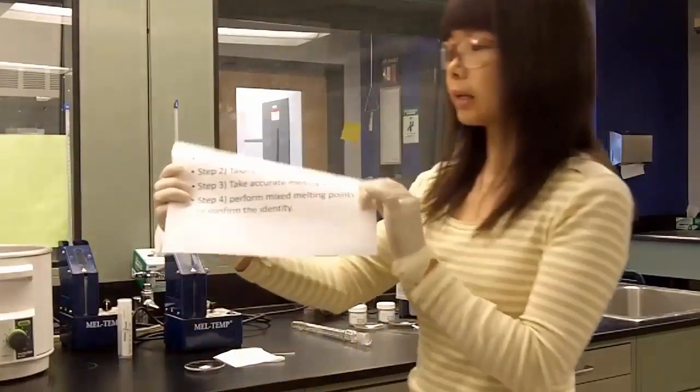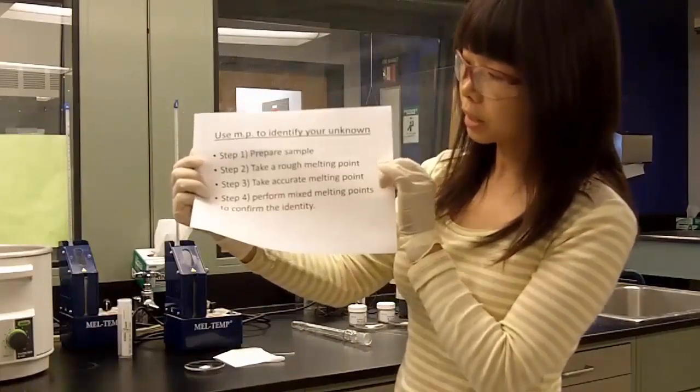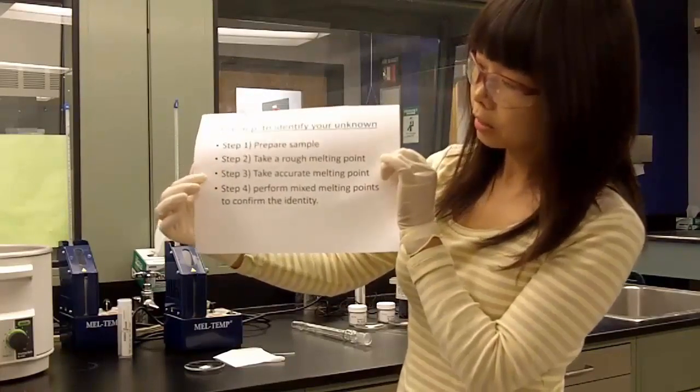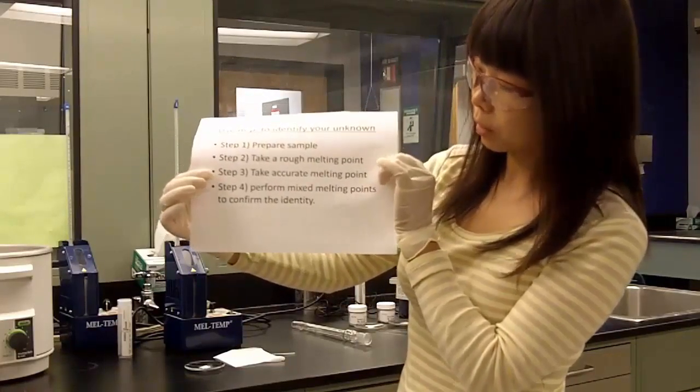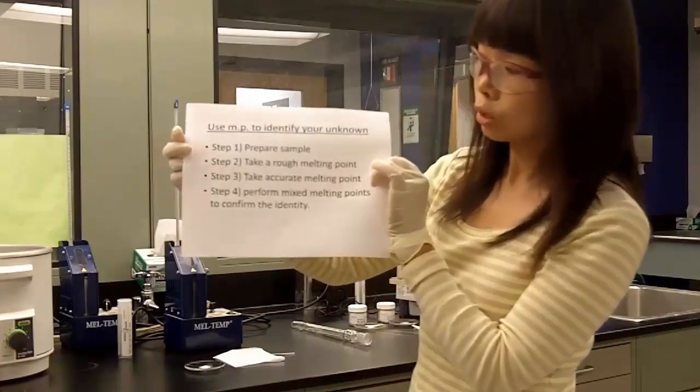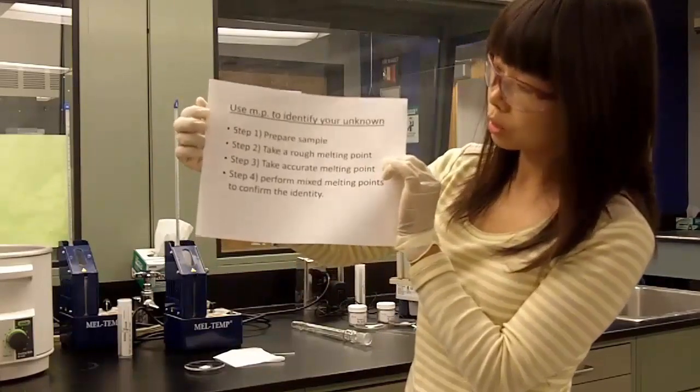So the steps to determine the identity of your compound: prepare the sample and take a rough melting point. We finished the second step already. And the next one, take accurate melting point. We already did this one. The accurate melting point is about 120 degrees to 123 degrees.